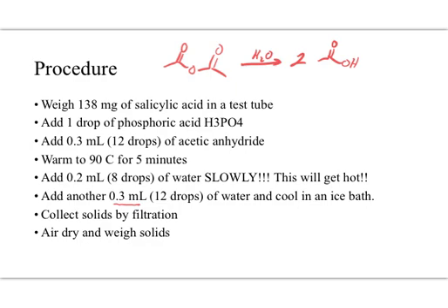At this point, we should be able to collect the solids by filtration. We're going to use all our crystallization techniques. If it doesn't crystallize right away, we're going to filter that solid, air dry it, and weigh the solid so we can get our yield for the reaction.